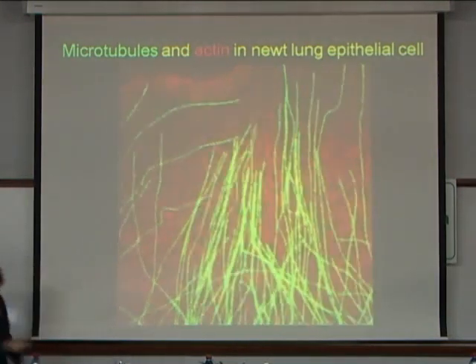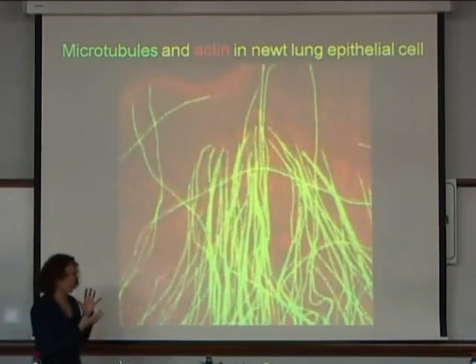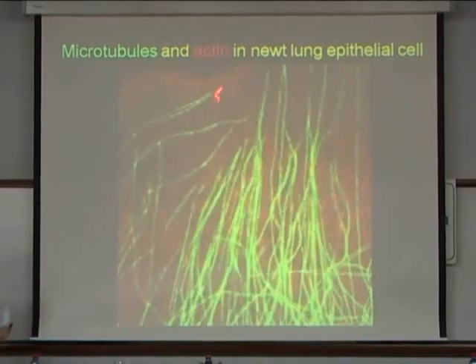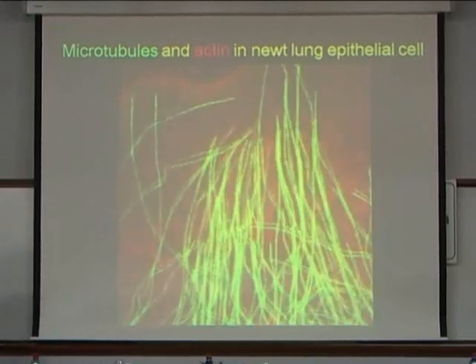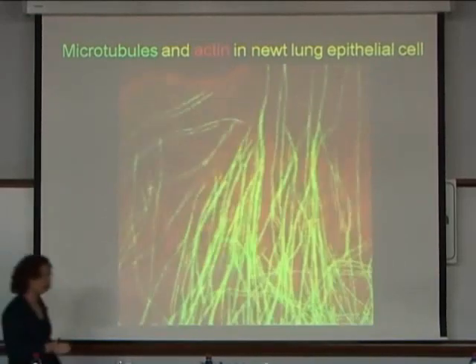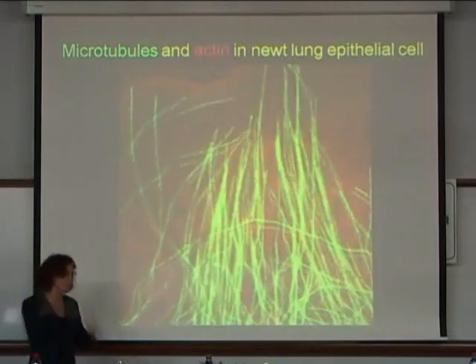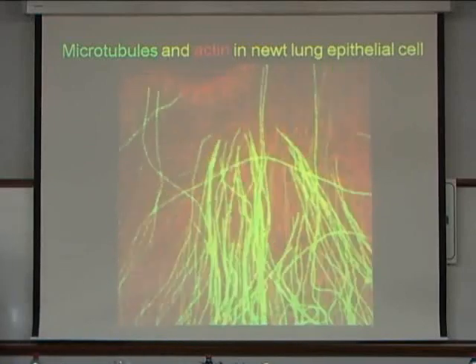Each one of these speckles is moving. That motion represents the motion of the actin material in which that fluorescent actin is incorporated. I have the actin in red and the microtubules in green. And the intensity fluctuations of each speckle represent the assembly and disassembly of fluorescent actin subunits in and out of that diffraction limited image region, into those actin filaments.